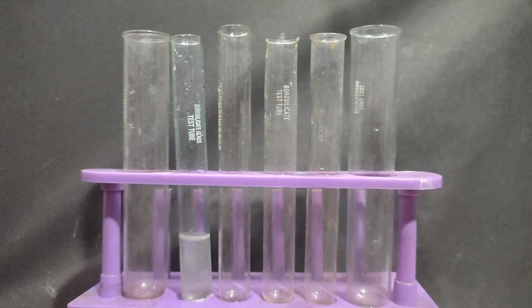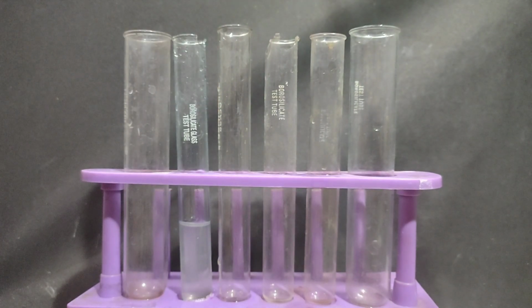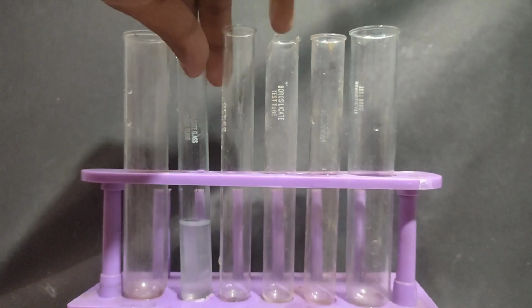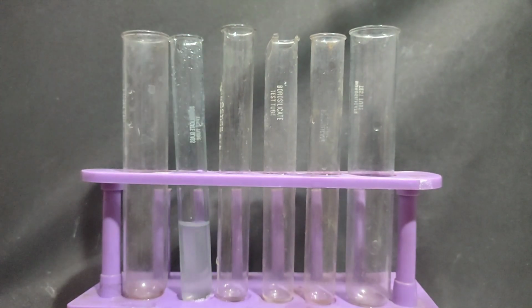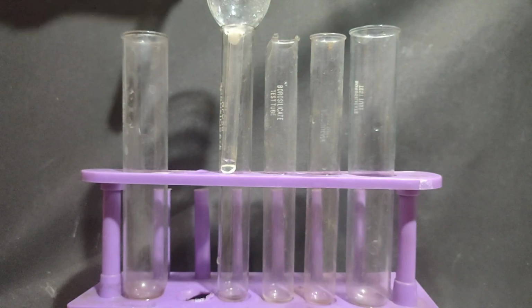So I'll be adding a bit of dilute nitric acid into it. Generally, I don't suggest making original solution in nitric acid because then it oxidizes the hydrogen sulfide gas into sulfur. But here, since I am showing you the precipitation of group 1, I have used nitric acid just to dissolve this lead nitrate completely. Anyways, it is not clearing up, so I will just filter it through some cotton.